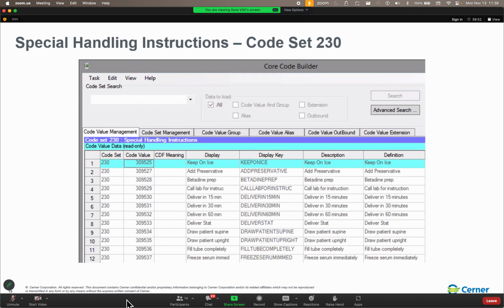Now, if it was an alpha prefix number, we'll say SP23, 1, 2, 3, 4, 5. That is again stored with 5 zeros, and then SP2023, and then 0, 0 on the left-hand side, 1, 2, 3, 4, 5.